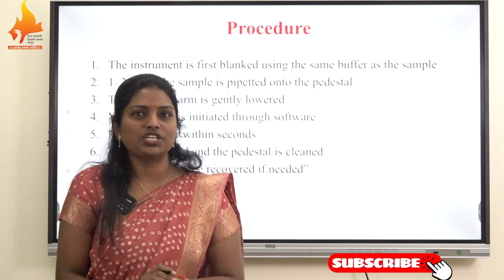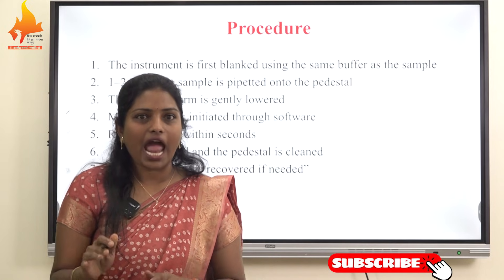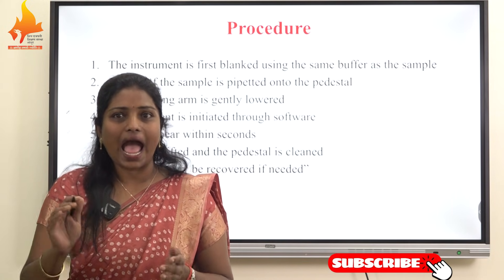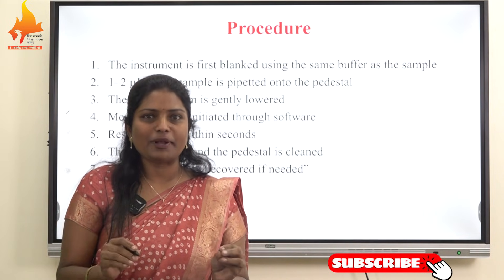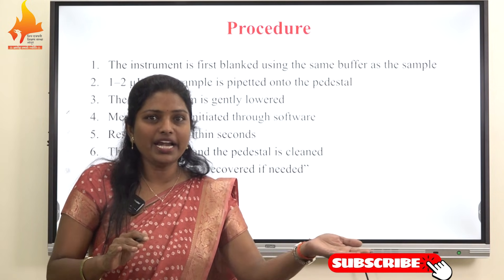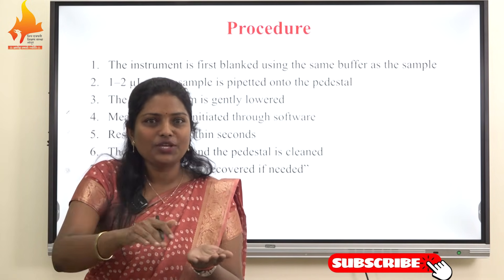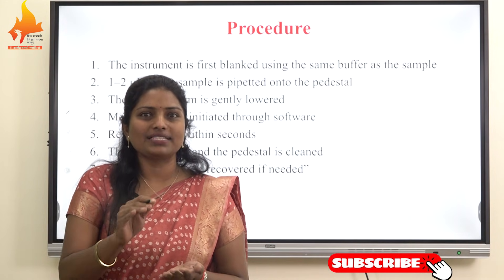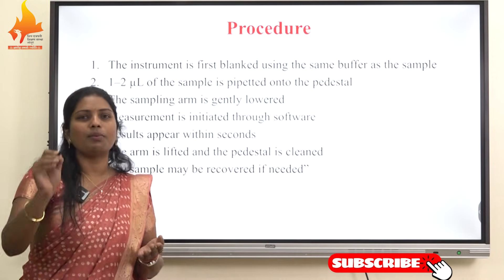Measurement is initiated through the software and the absorbance spectrum is recorded. The results appear within a few seconds, displaying the concentration and purity ratio. After measurement, the arm is lifted and the pedestal is cleaned using a lint-free tissue. If required, the sample can be recovered using a pipette.